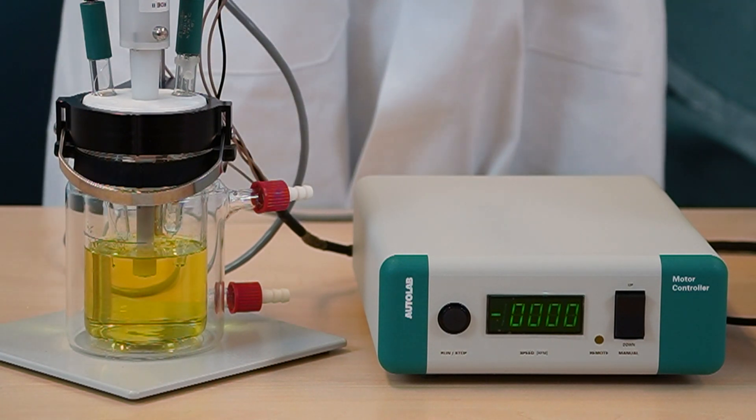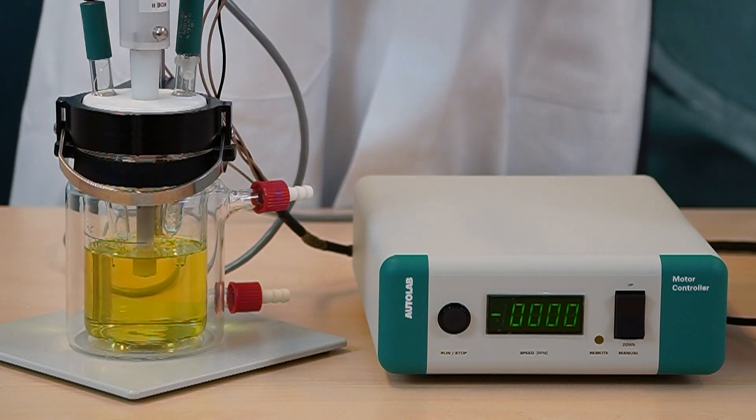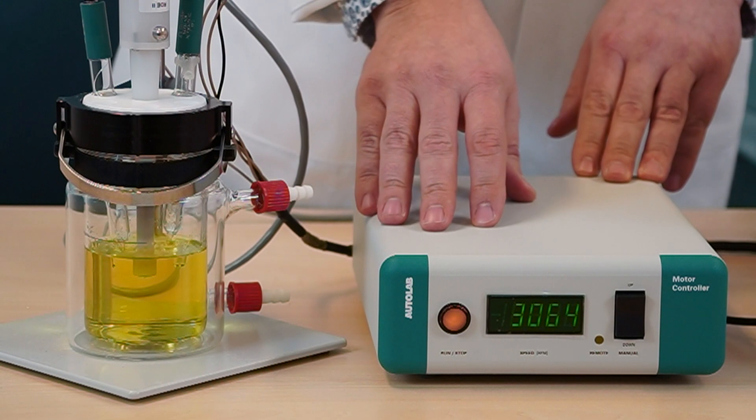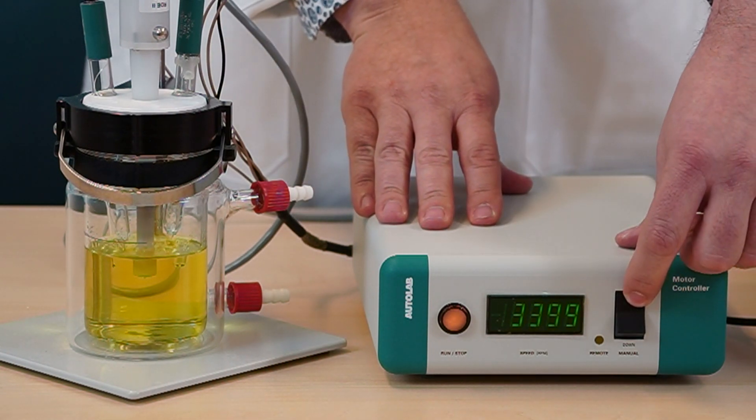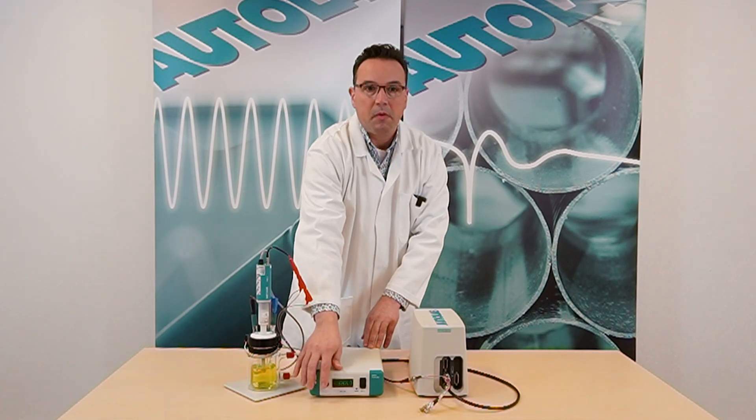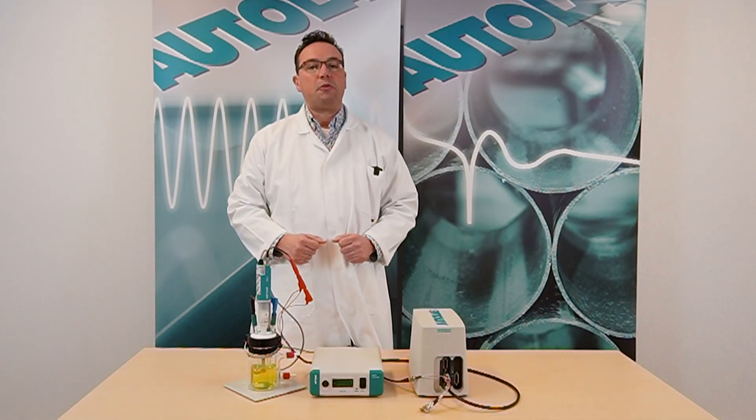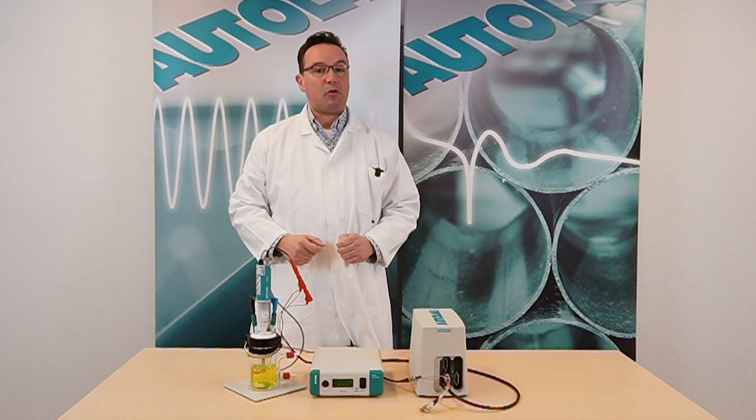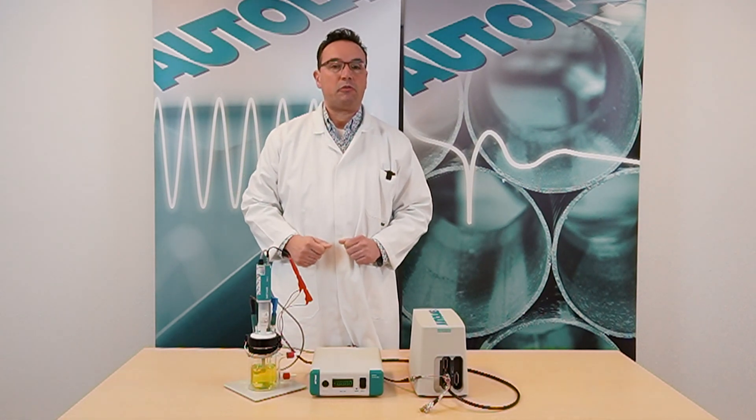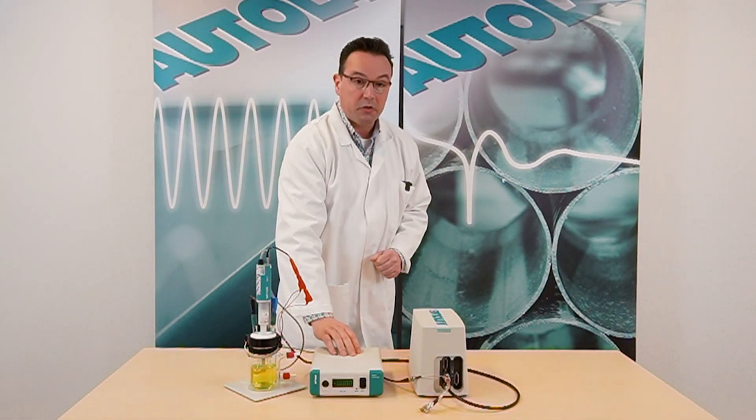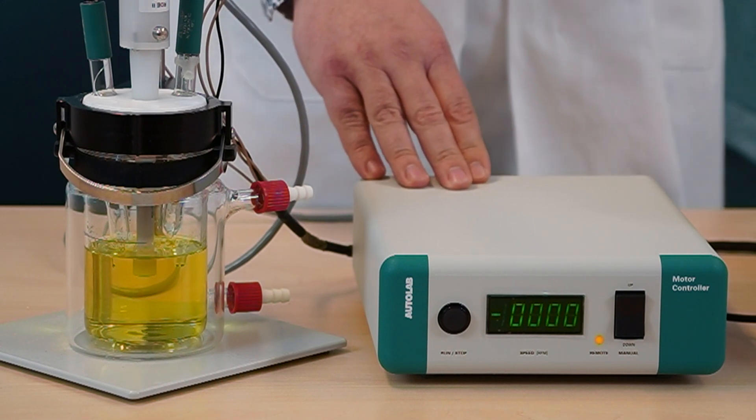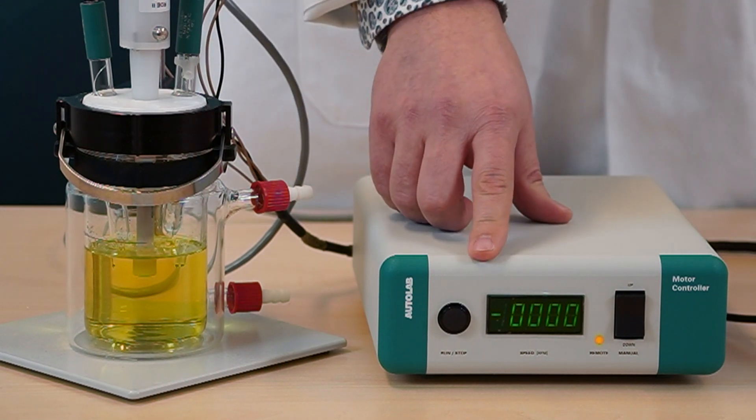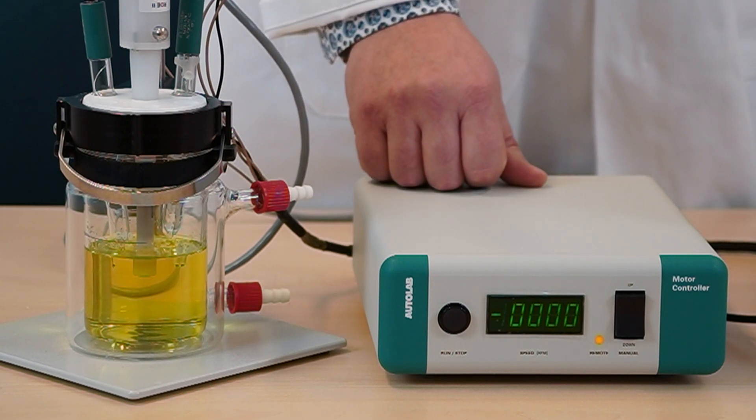The rotation speed can be set manually with the switch on the front panel of the motor controller. The rotation speed can be adjusted with this button here. I will switch off the manual control, because in this experiment we are using the analog output of the Autolab PG-Stat to control the rotation speed of the rotator through the NOVA software. When you are operating the rotator using the remote feature, an orange light will appear in the front of the motor controller.